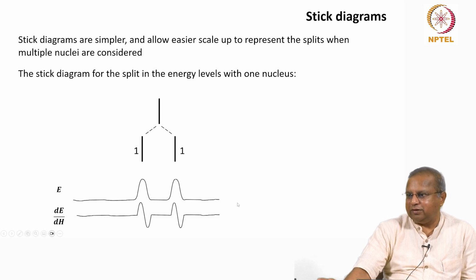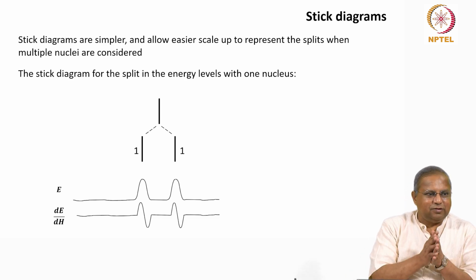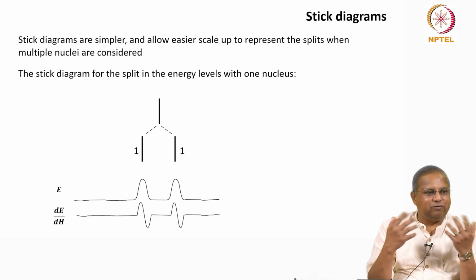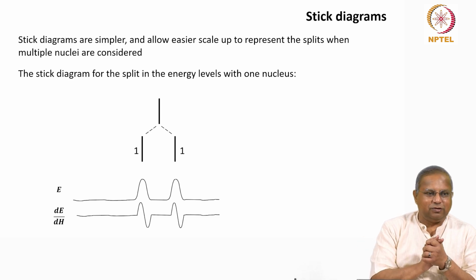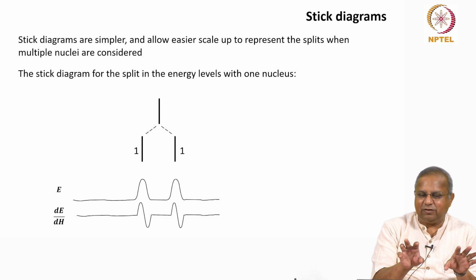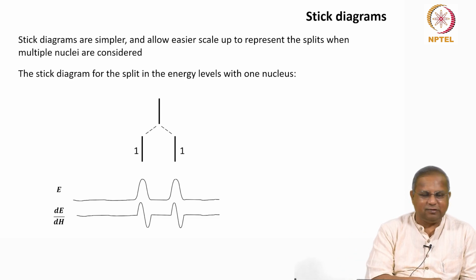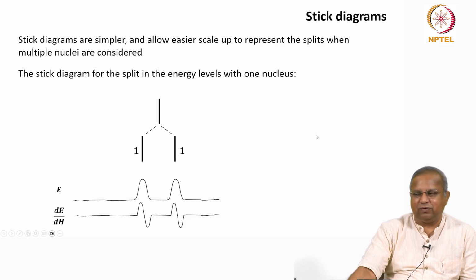So now you know why EPR can be very complex. All the principles that go towards generation of the spectrum are very fundamental, fine. But you have a complex set of interactions in any system, and therefore, as long as you have simple enough and only that species present, the interpretation is very straightforward. Otherwise, deconvolution is quite a pain.